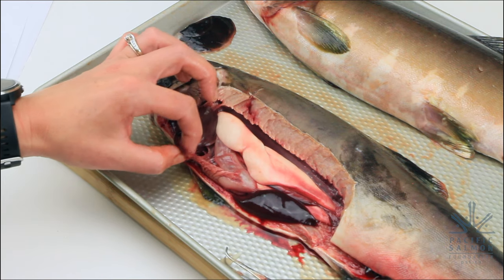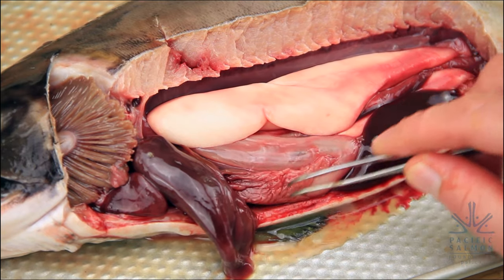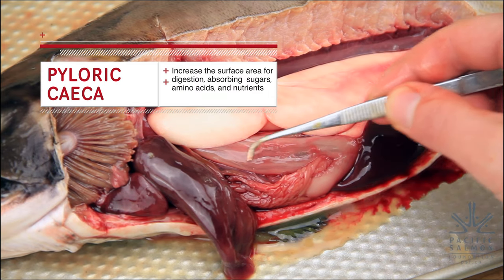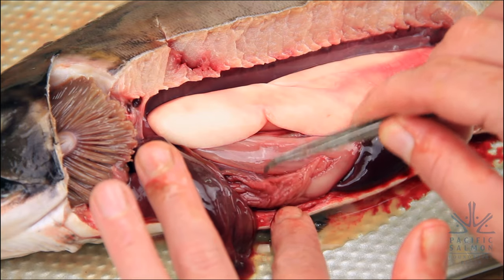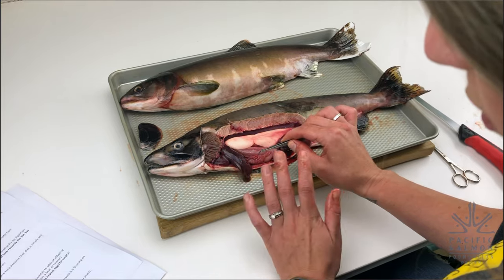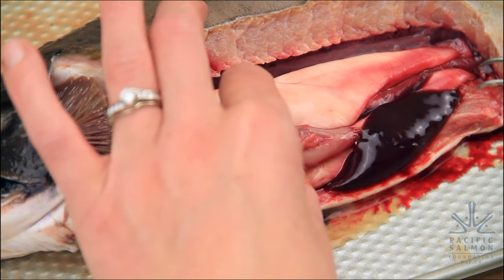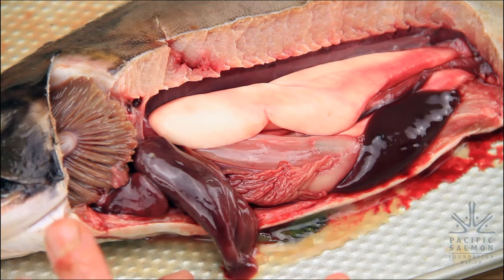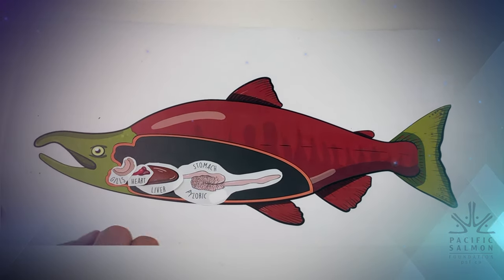If we lift the liver up a little bit, you can see these noodle-like or finger-like structures — those are called the pyloric ceca. They're attached to and surround the stomach, and they help to speed up digestion. All these little finger-like projections increase the surface area, which helps increase nutrient absorption. This is especially important because fish's stomachs are a lot smaller than ours, so they need to eat and digest food quickly. Cut out the stomach and surrounding pyloric ceca and put them in the correct location in your fish diagram.